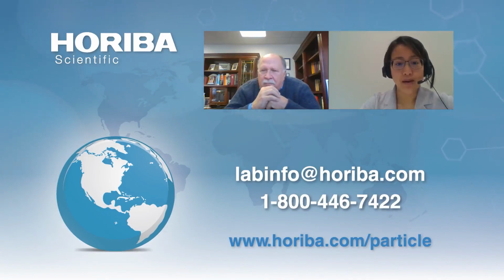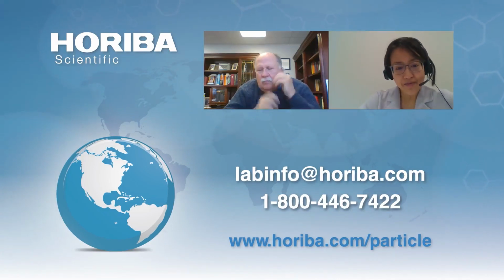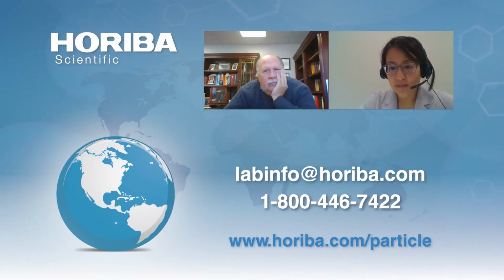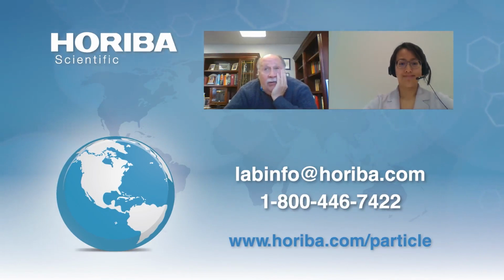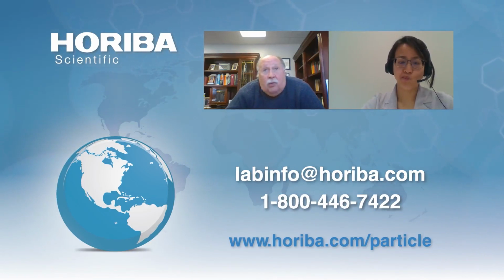Okay. The next question is kind of contradictory. How can we avoid agglomeration? Right. So typically what you'll do, you want to put something in there to keep the particles from coming together.